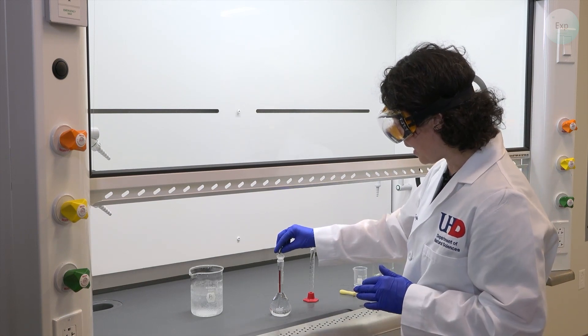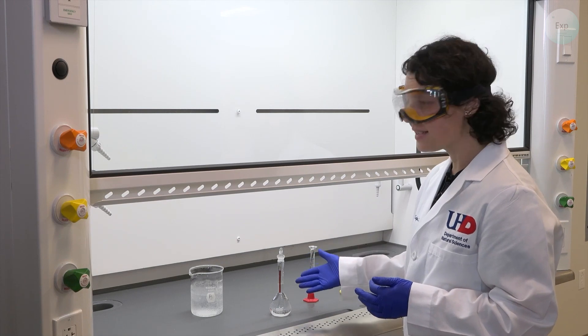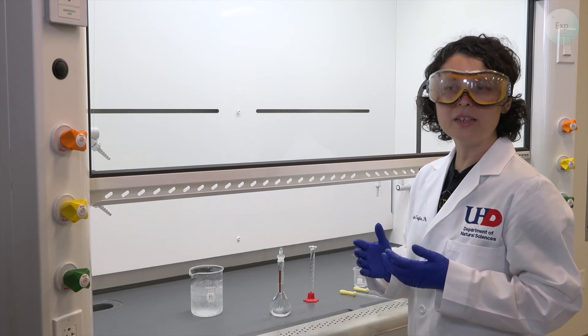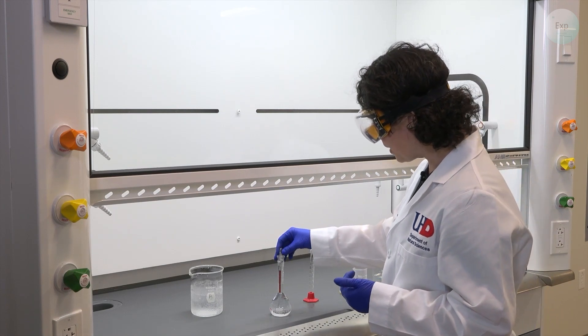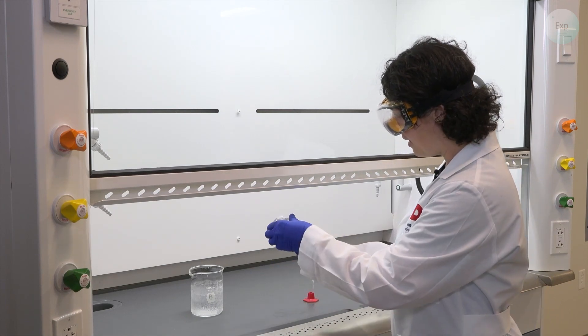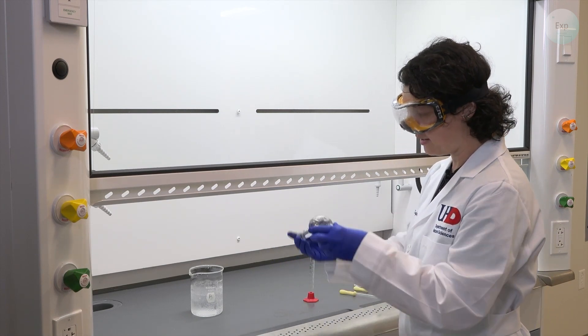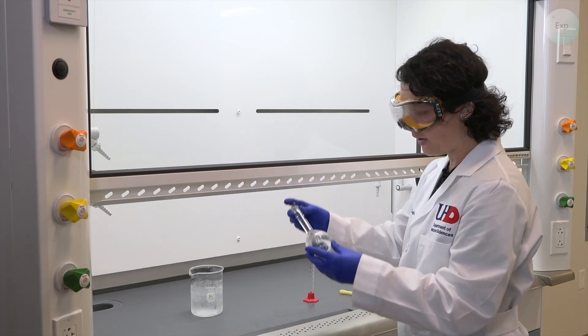We have the right amount of solute and the right volume of solution inside our volumetric flask. The only thing that's missing is for this solution to be homogeneous. And for that, we're going to place the cap on top and then move it side to side, up and down about three to five times.